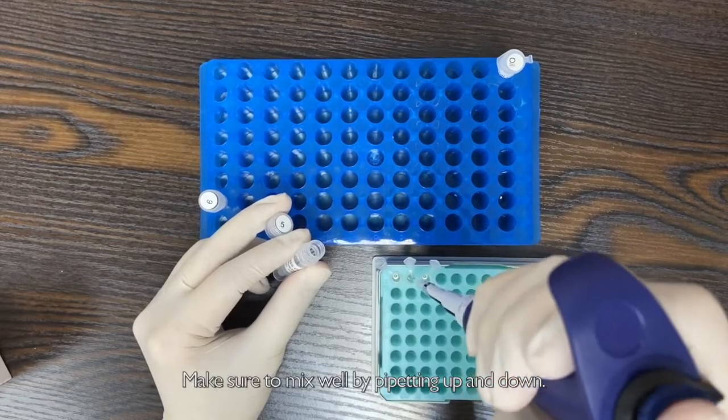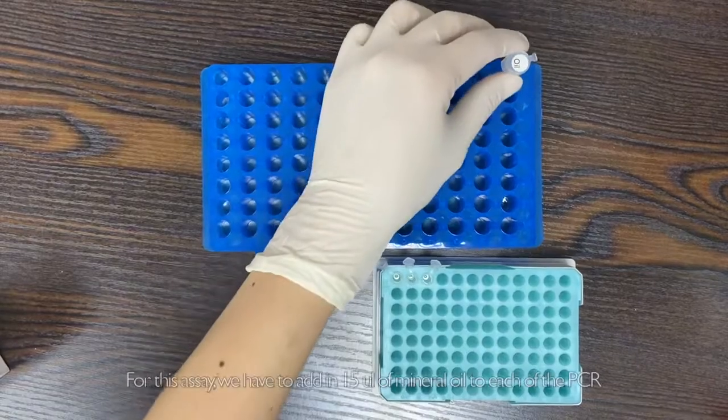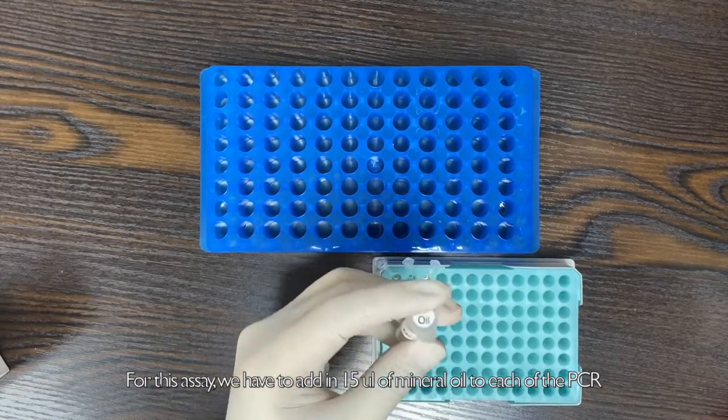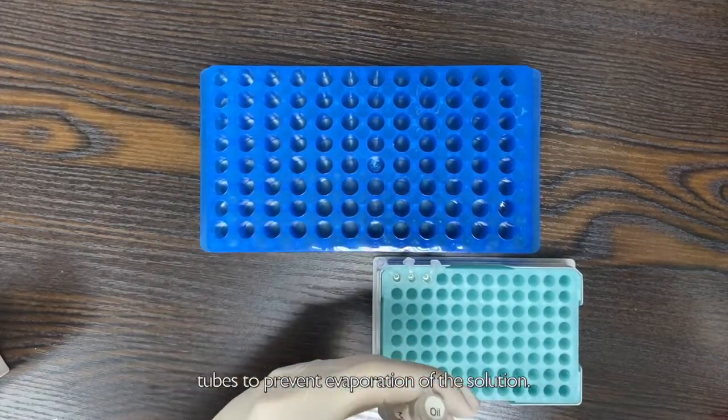Make sure to mix well by pipetting up and down. For this assay, we have to add in 15 µl of mineral oil to each of the PCR tubes to prevent evaporation of the solution.